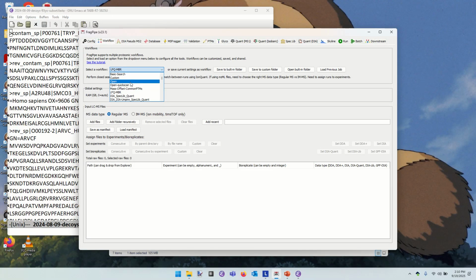I might also look for minus 18. Why would I look for minus 18 on that?